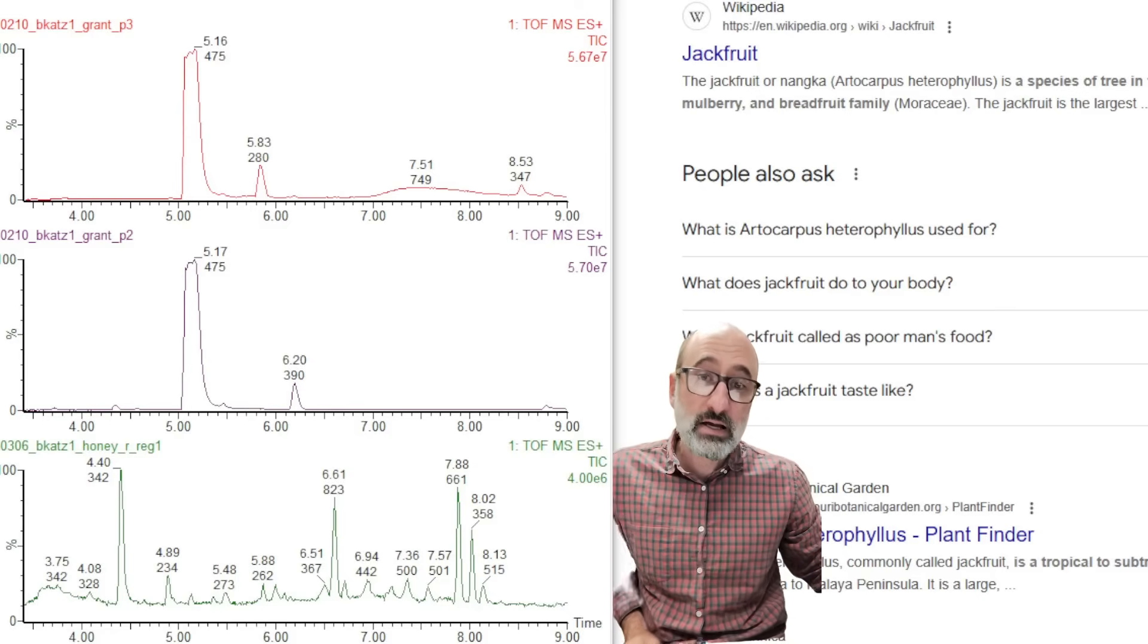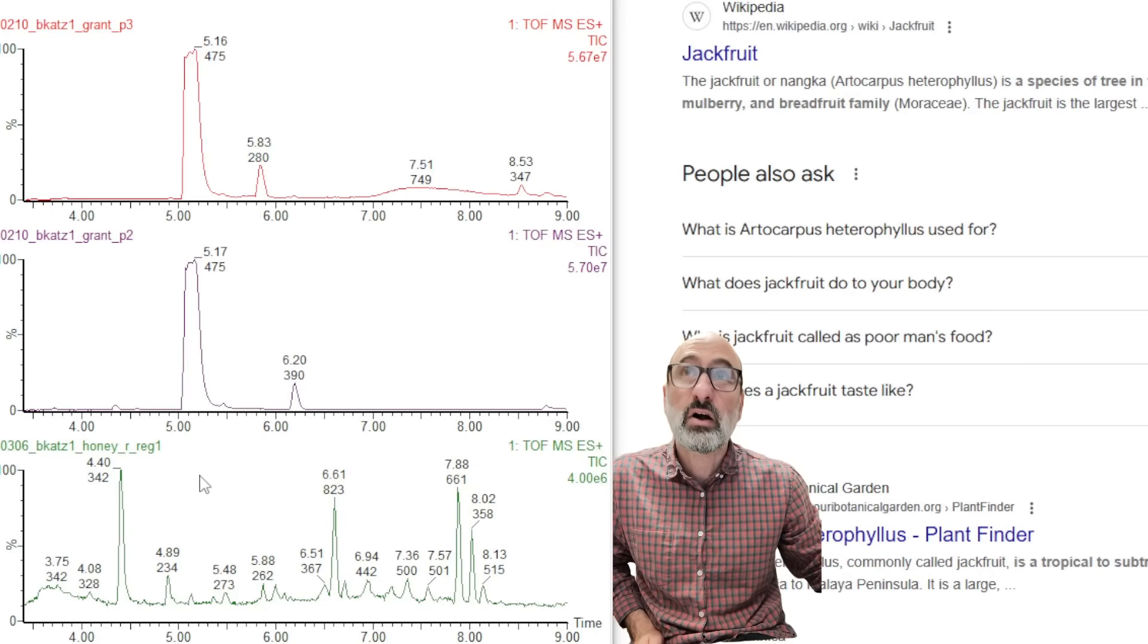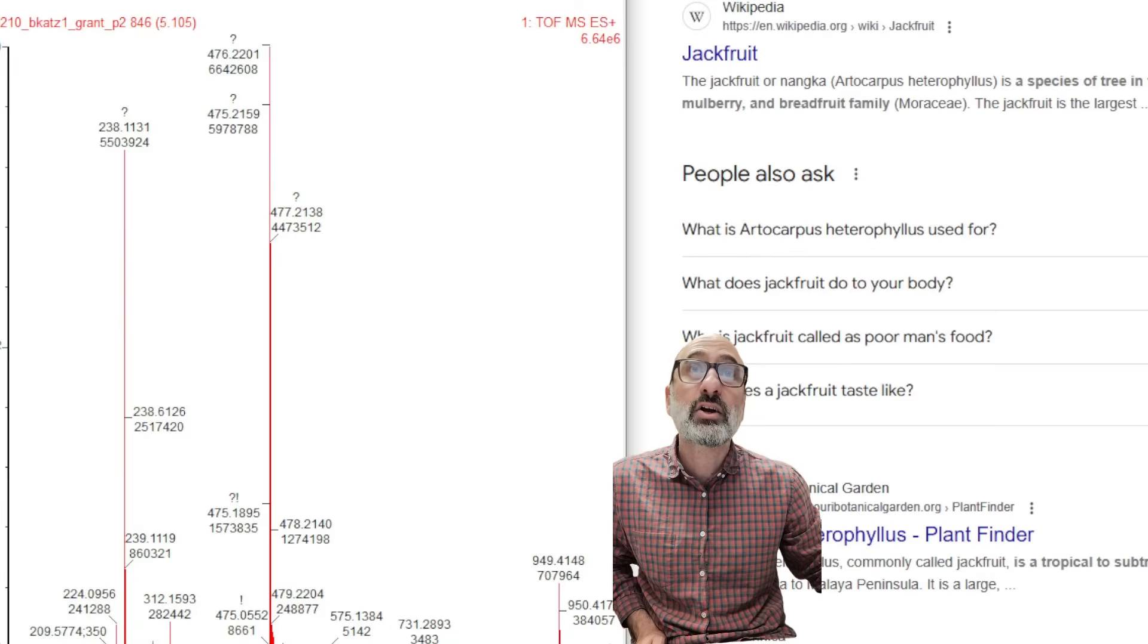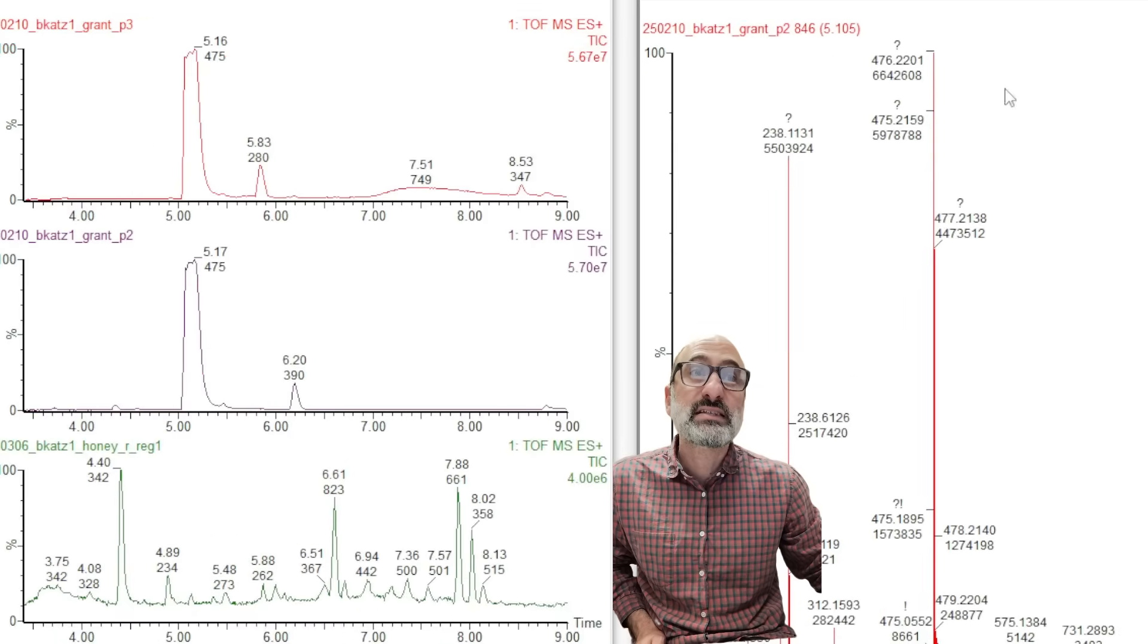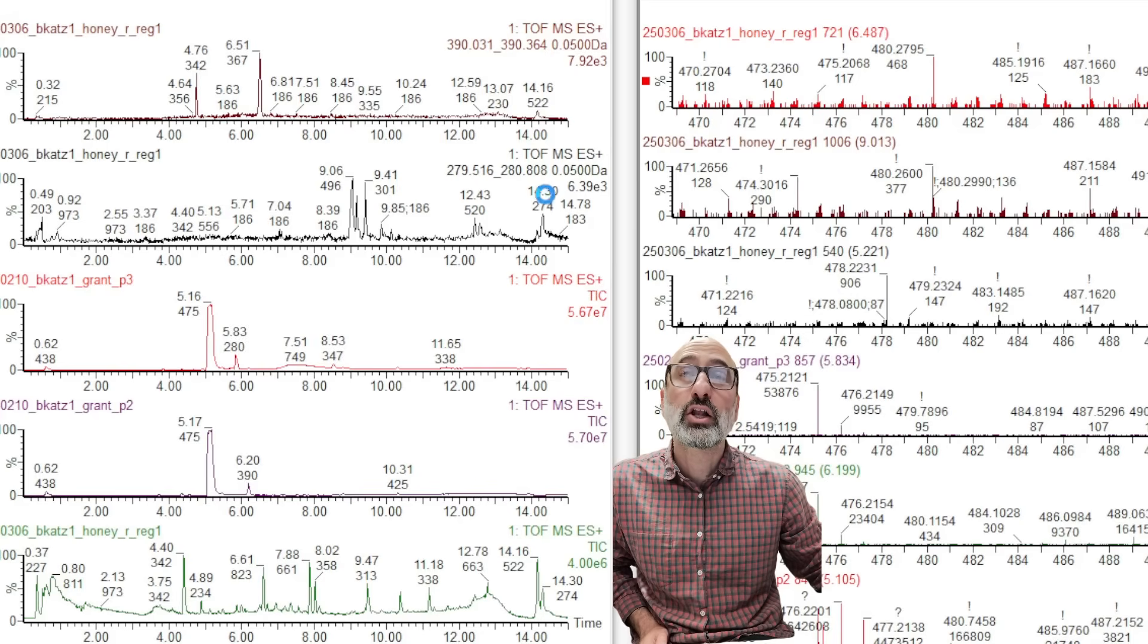All right, so to confirm or deny the myth of the Royal Honey packs from the gas station have just Viagra or another thing that would be in one of these ED supplements at the gas station. Here's the two other Grant Harding samples, this P2 and P3 supplements that he sent to me. You can see this huge 475 mass right here. 476 is the Viagra. That's the Viagra. Is that in the Royal Honey anywhere? Let's take a look.